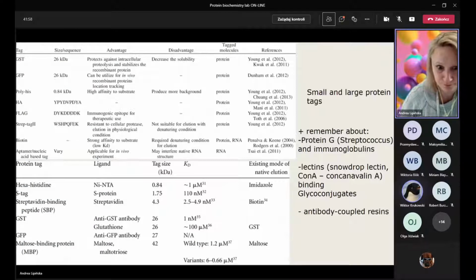Maybe about the start codon. Is it that in every type of plasmid we use, we don't use the start codon, or in some cases we might have to use it? Okay, yeah. Well, it all depends on the tag and the position of the tag.